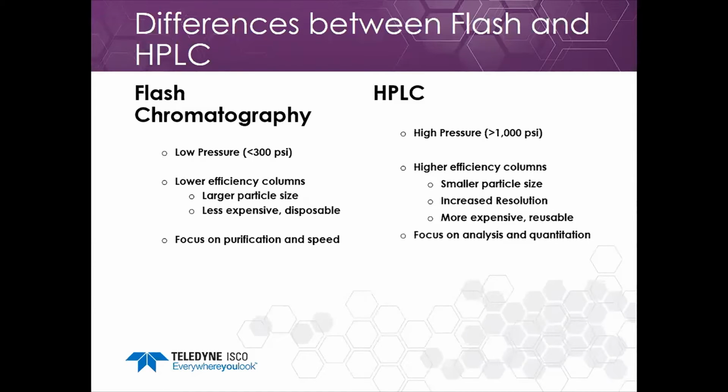While HPLC is traditionally a focus on analysis and quantitation, so we really need a pure separation where these compounds elute at different times so that we can analyze them and quantitate them. We're not interested in peaks overlapping. We want clear baseline resolution between peaks. Traditionally, with the increased resolution, this also offers a great late-stage purification for compounds to really bring your purity up into that 99% range.